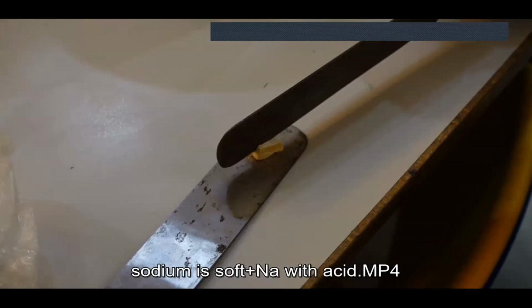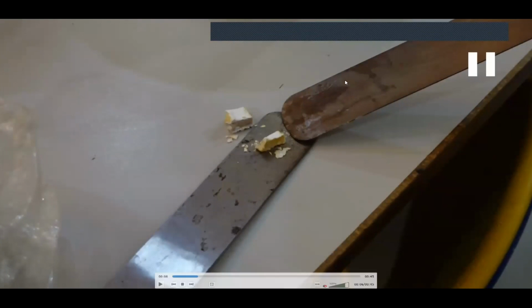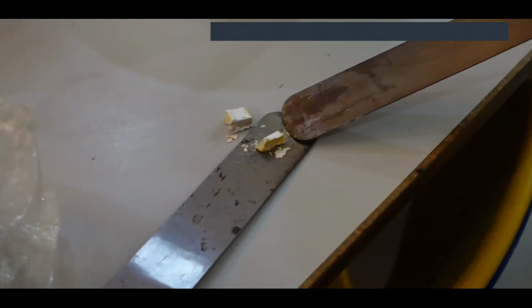Again, I'm doing this again, but this time I'm reacting it with acid. So there you go. Notice this side of sodium, it's really shiny, grayish, with a very straight edge that shows there's a layer in there. So all of those things we can make observations of what the metal is like. It is soft, it is floating, so it is low density, and it is shiny. Now let's see what happens. So I'm going to add this to acid.